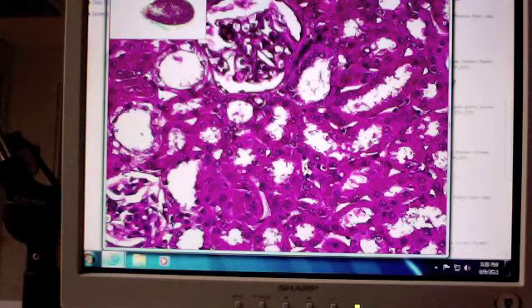And then, of course, the other way I could word that question would be to say the arrow is spanning the cell of what kind of epithelium? And that would be the next guy along. My arrow is spanning a cell of what kind of epithelium? It looks like simple cuboidal. Simple cuboidal epithelium. Very good. Okay. Good job, man.